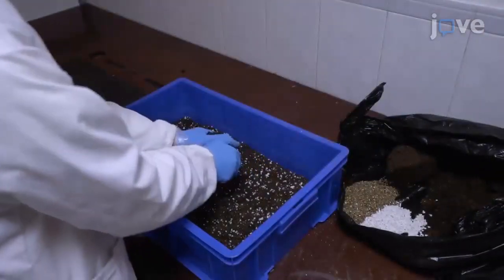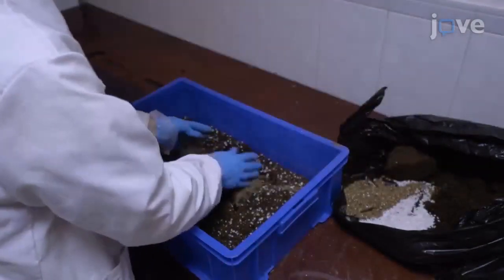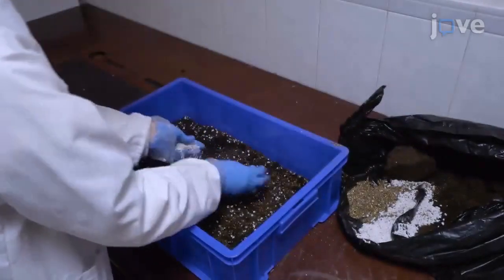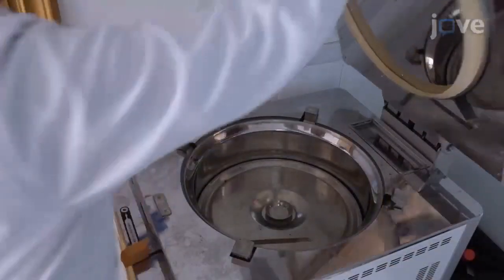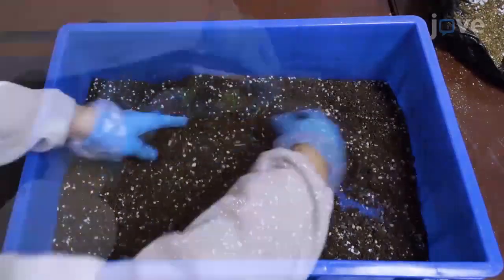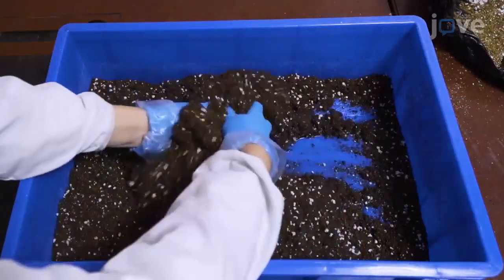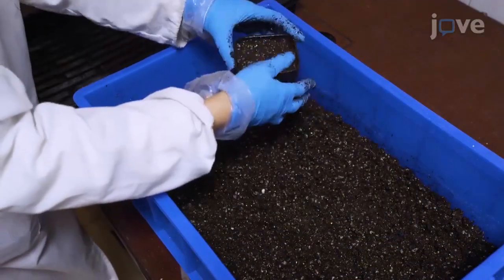Prepare potting soil mixes consisting of 50% peat moss, 30% perlite, and 20% vermiculite, and autoclave at 120 degrees Celsius for 20 minutes. Soak the autoclaved soil mixes with plant fertilizer solution at 1 gram per liter and sub-package them into smaller pots stored in a larger tray.